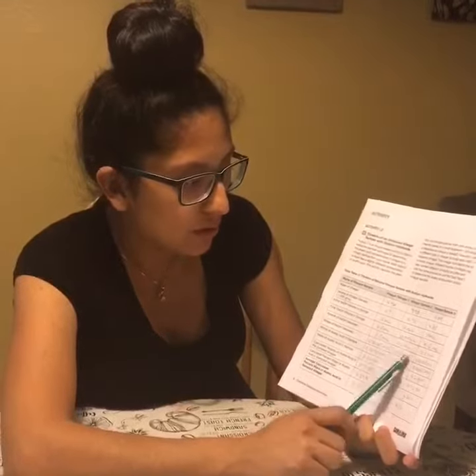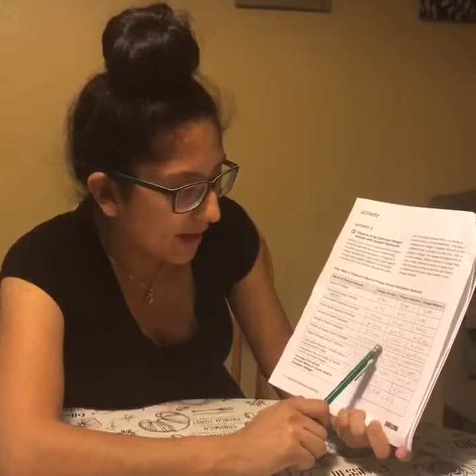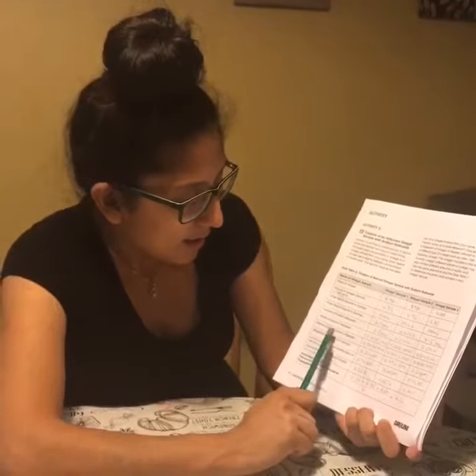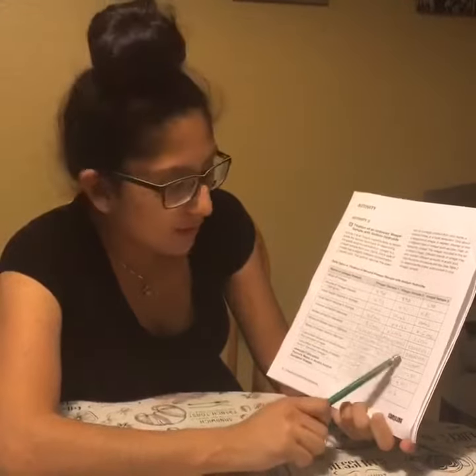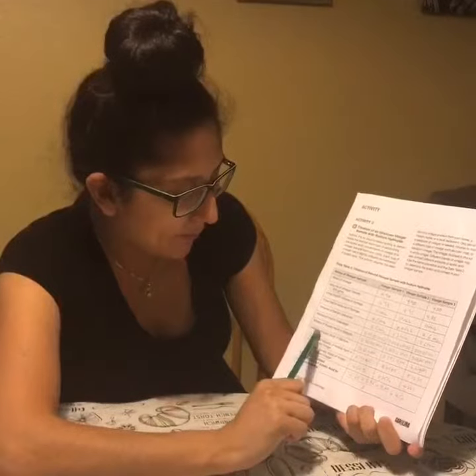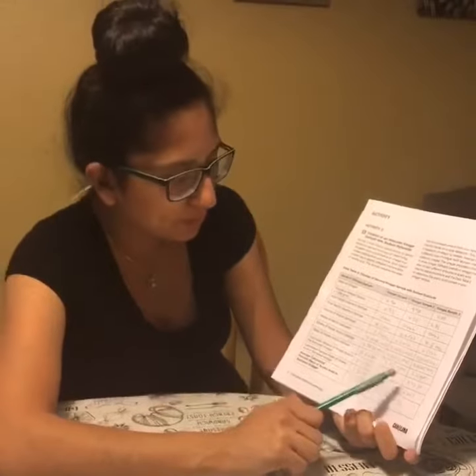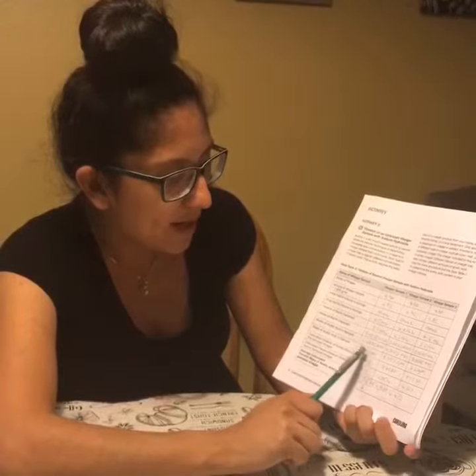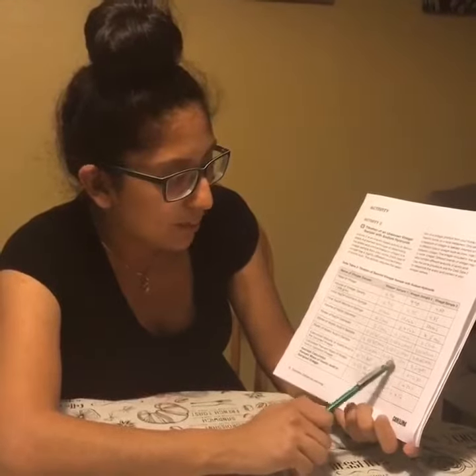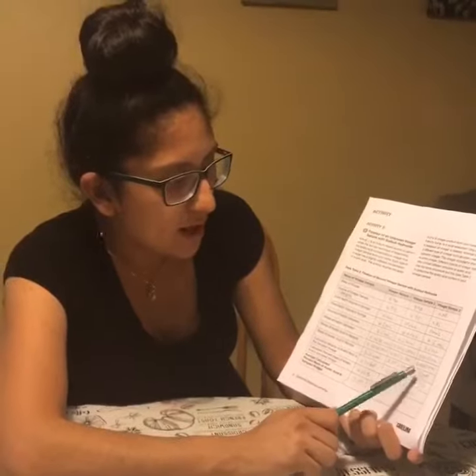Vinegar sample 2 had a 3.2, sample 1 and 3 had 3.5. The moles delivered, again, same thing. The moles of acetic acid in the sample was the same as the moles delivered, so no difference, same as data table 1. The mass of acetic acid in the sample, there was a big difference in this one. For vinegar sample 1 I got 0.21, for sample 2 I got 0.192, and vinegar sample 3 0.21.